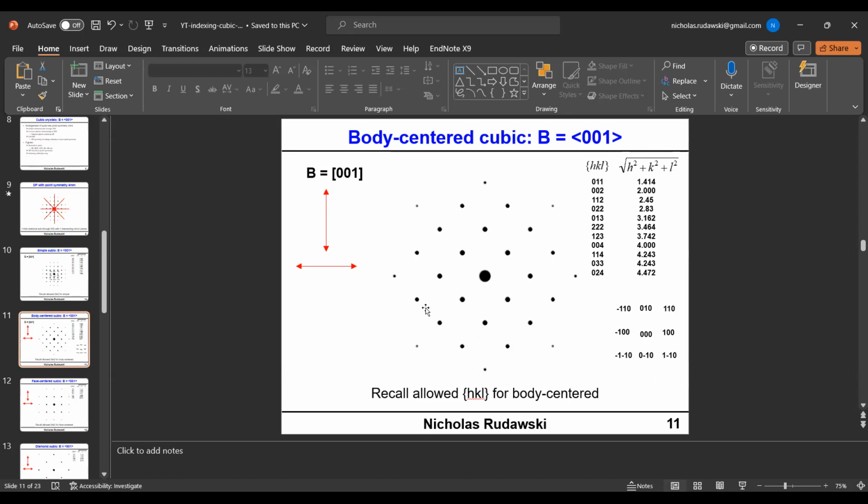So we'll start by assuming that here's my shortest G, and this is my orthogonal, which is also the same length. Let's start by assuming that this is in the 0, 1, 1 family. Once again, let me delete some of these to avoid a little confusion here.